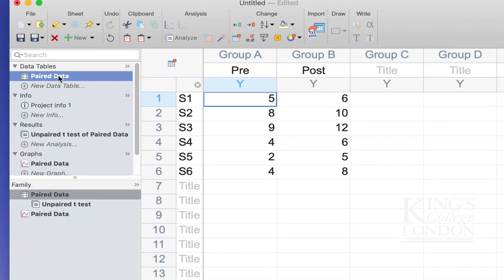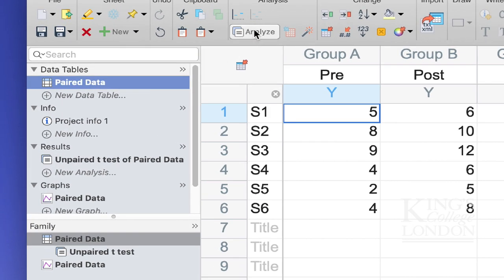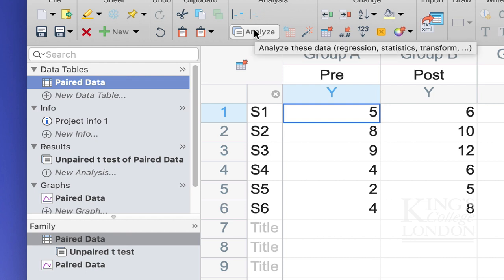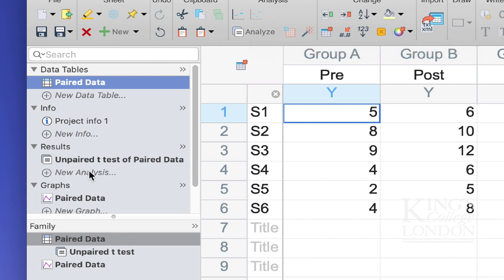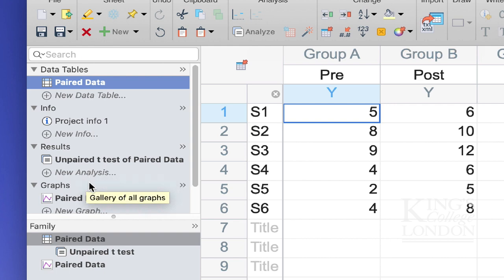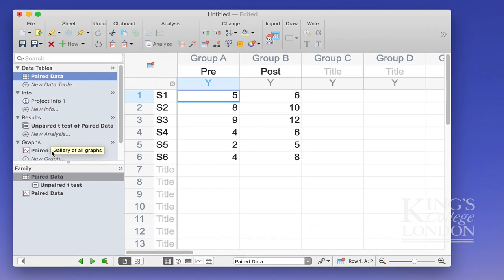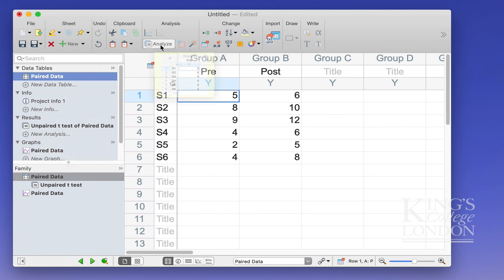In order to do so, I can click on the analyze button on the analysis toolbar, I can click on the new analysis in the results section, or I can go to the graph and also click on the analysis button. But for the purposes of this demonstration, I'll click on the analyze button on the analysis toolbar.